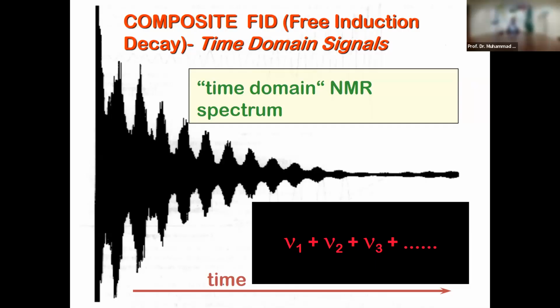The other is called spin-spin relaxation, and that is just an energy transfer from one proton to the other in the case of a proton NMR spectrum. It just dephases the signal, but it is not really an effective mechanism of relaxation or losing energy. So actually what we are interested in is T1 relaxation, and I'm going to tell you in the subsequent experiment how T1 is calculated.